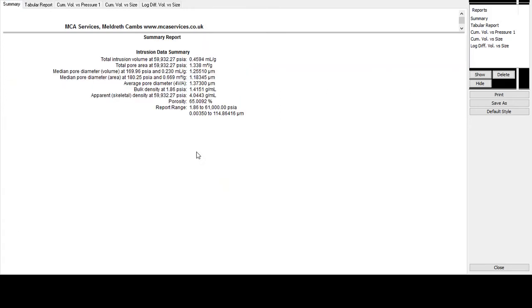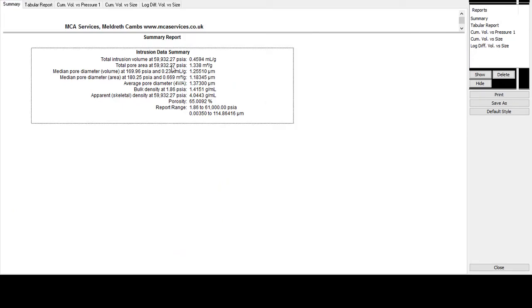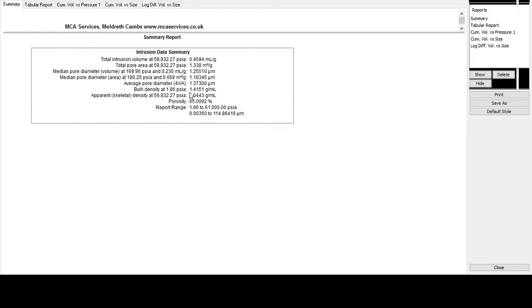So we'll start with the summary data and we can see that the intrusion volume or effectively the pore volume of this sample is shown here, 0.46 milliliters per gram. The various measures of pore size are shown here. So the pore diameter, the median pore diameter from the intrusion volume data is 1.26 microns. We've also calculated the bulk density or envelope density, and it's 1.42 grams per milliliter or grams per cc. And we've got the porosity of the sample as well. That's 65% porosity.